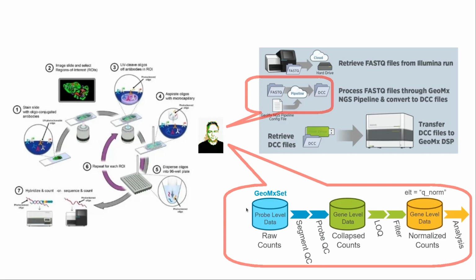So what we do at MoMA is that we make an analysis report in the HTML format, so you can look at it in a browser, and I'll go through what is the content of such a report.